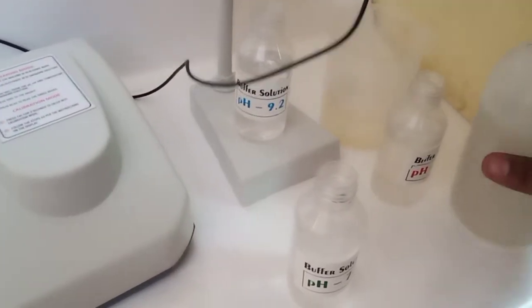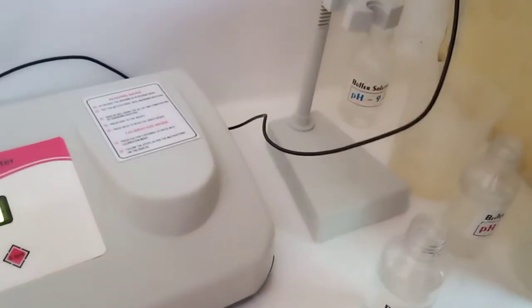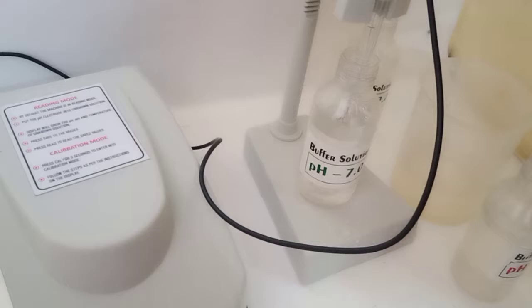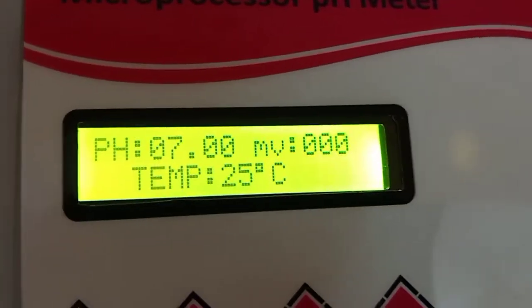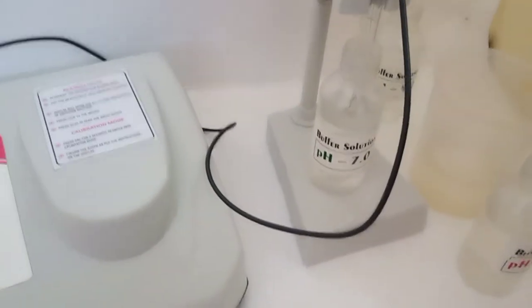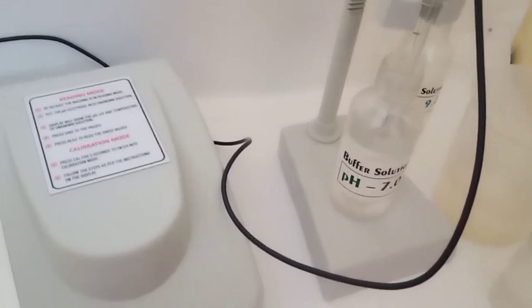Before changing the solution, wash the electrode thoroughly with distilled water. Now we are putting the electrode into the 7 pH buffer and checking the results. The machine is also showing 7 pH — that means our calibration is proper. The machine is now ready to measure any sample value.